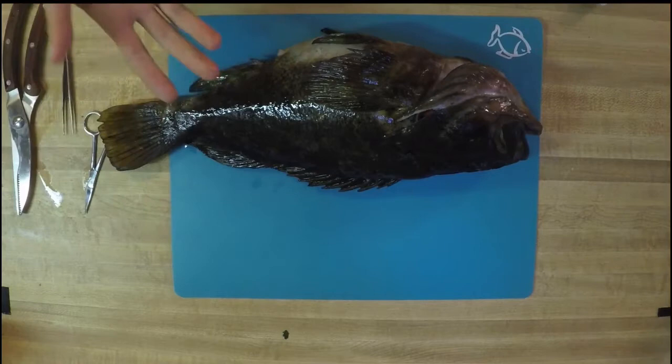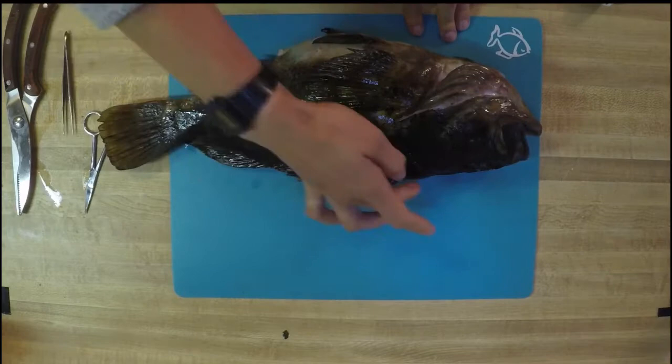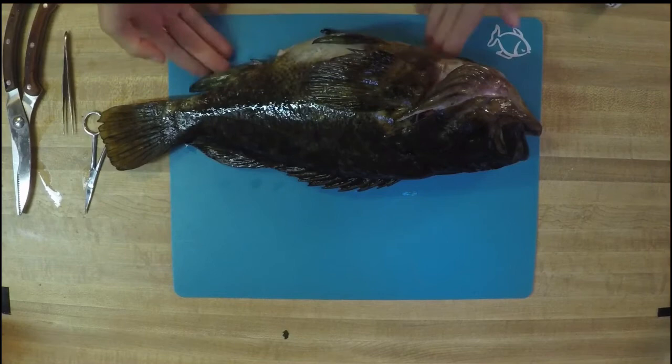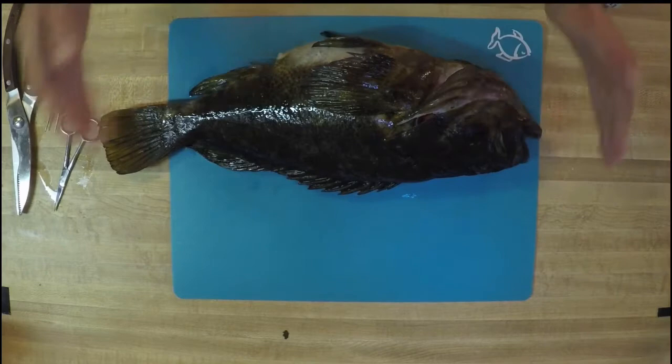Before I explain the fins, I'm going to explain kind of the directionality of the fish. We'll be explaining four terms that we'll be using probably throughout our dissection. The first is dorsal — the backside or top side of the fish is what we call the dorsal side. The belly side of the fish is what we call the ventral side. The front is anterior, and the end, the tail, is posterior.